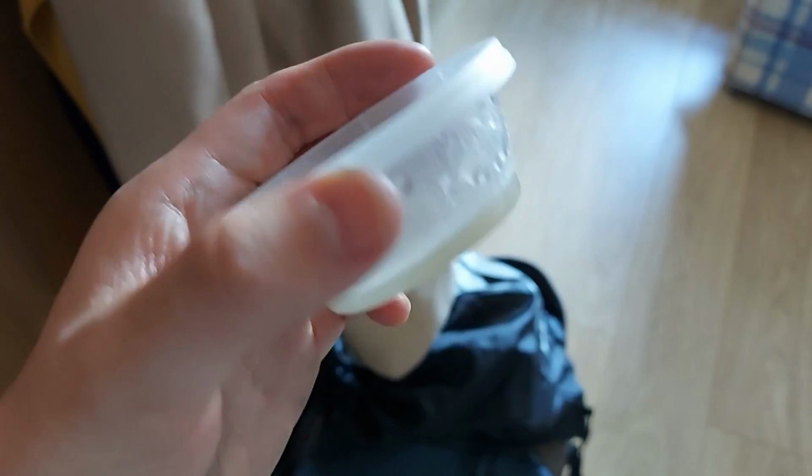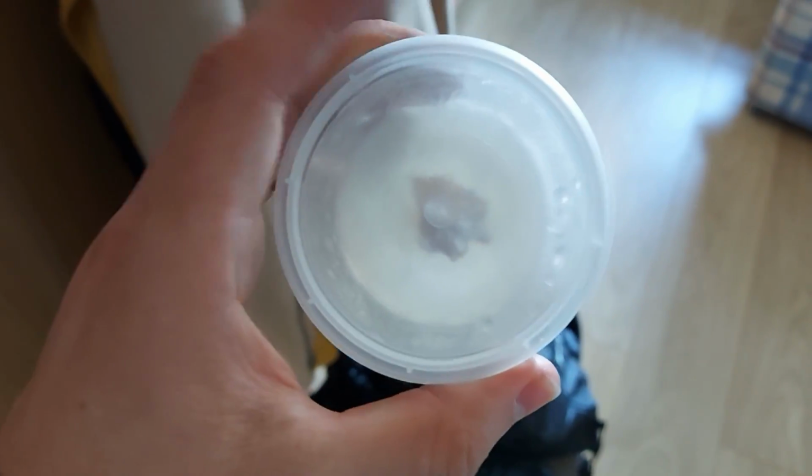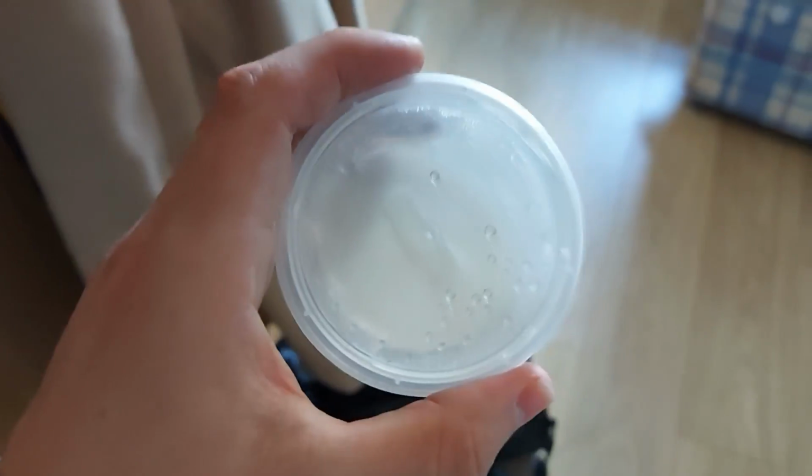Here is my fridge, which I keep all my agar work inside. This is some turkey tail that I cloned from the park. The next one is oyster mushroom. Later in this video, you'll see us clone the oyster mushroom. This is a transfer from that clone.